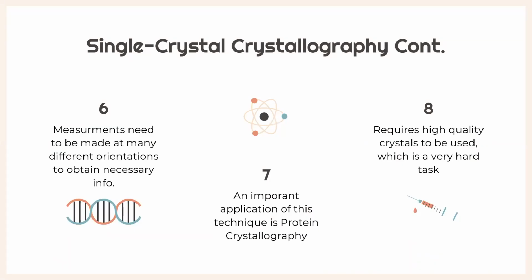Measurements have to be made at many different orientations in order to obtain the necessary information. A very important application of this technique is protein crystallography, a central technique in molecular biology. This technique requires high-quality crystals, which is often a very hard task.